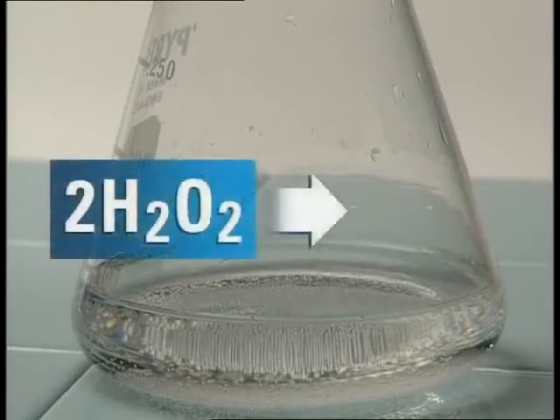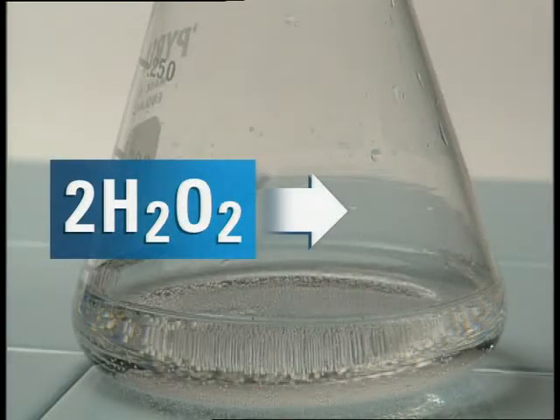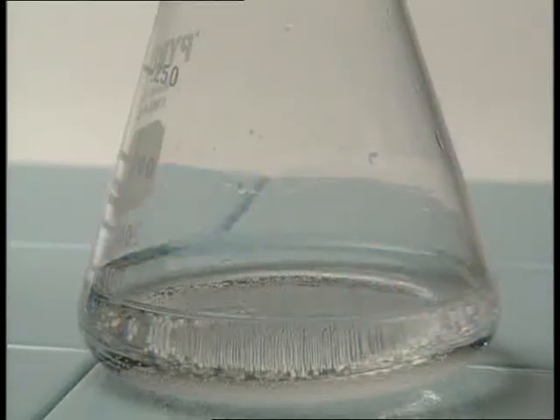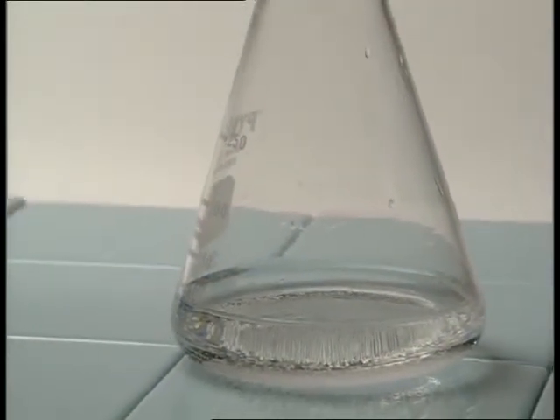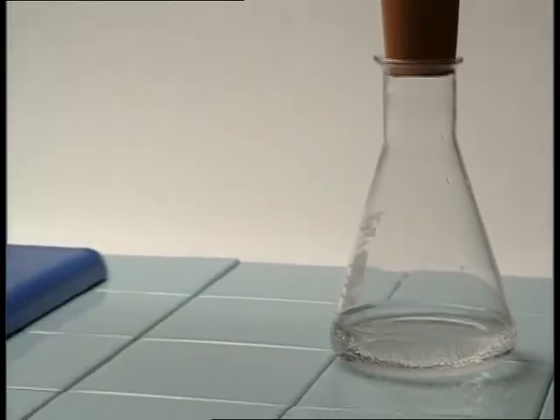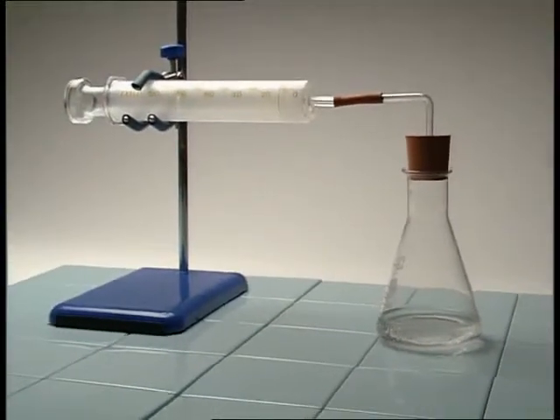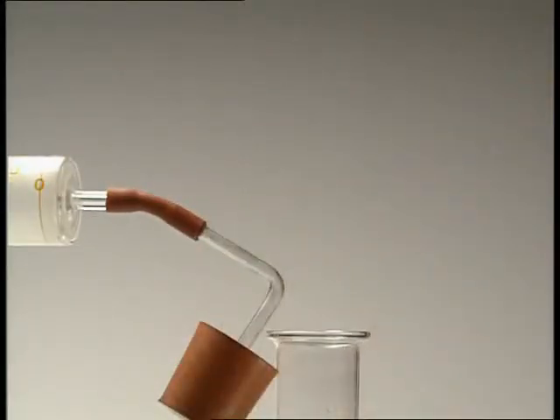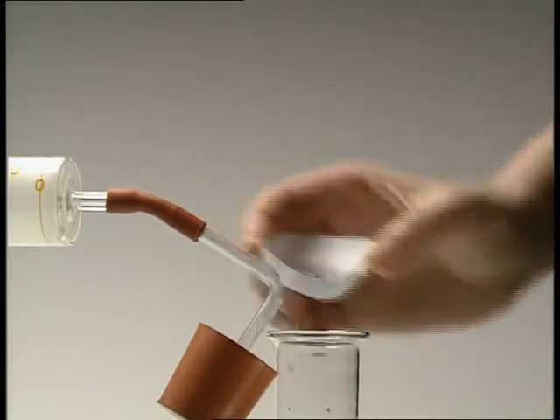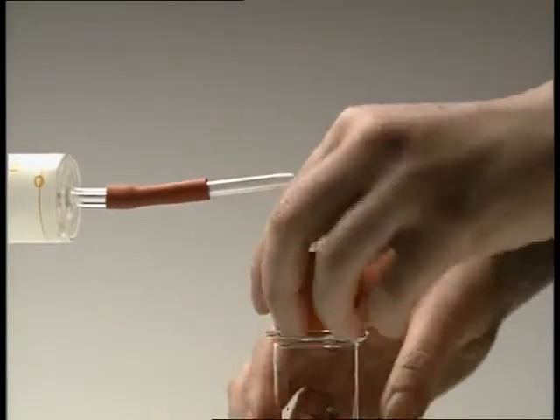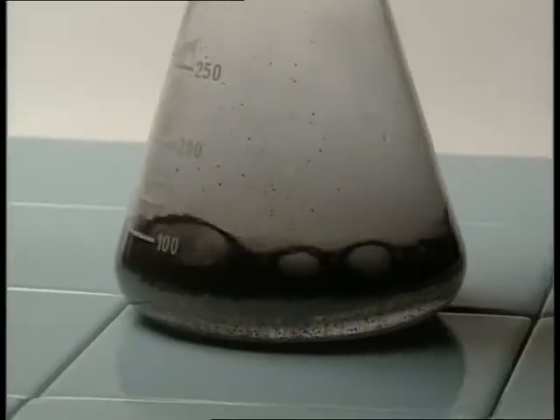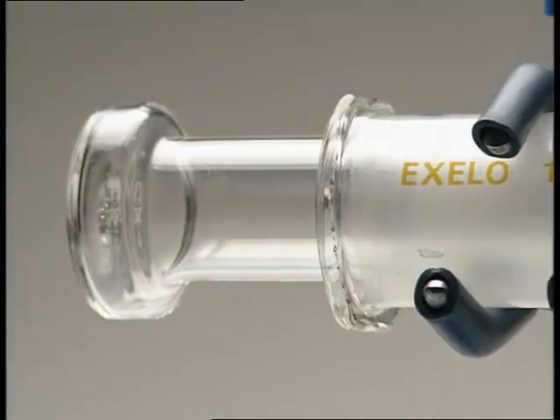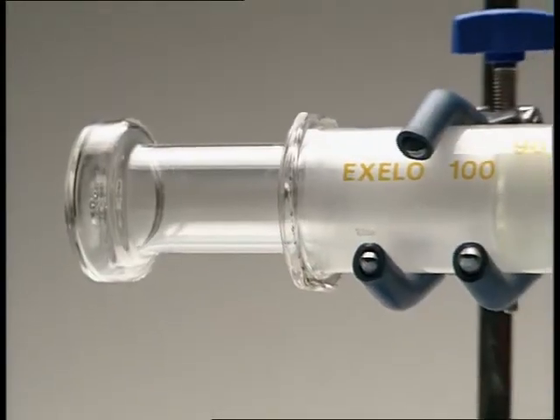This is hydrogen peroxide. It slowly decomposes to form water and oxygen. Any oxygen produced will be collected in the syringe, but at room temperature the reaction is so slow you'd think nothing was happening. One way of speeding up a reaction is to add a catalyst. Add manganese dioxide and the hydrogen peroxide quickly decomposes, producing oxygen.